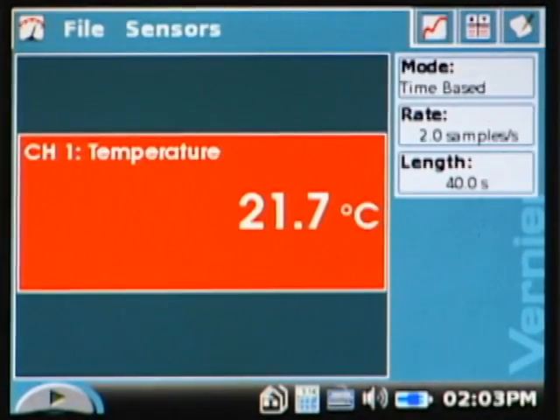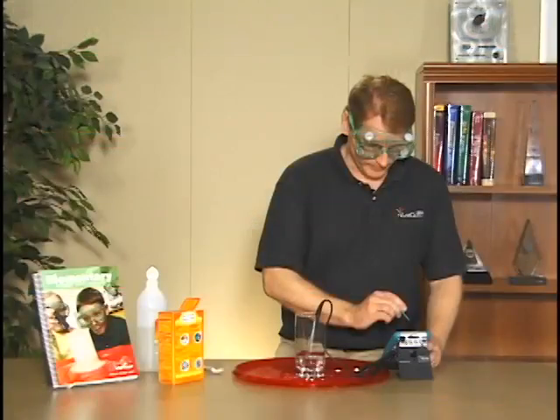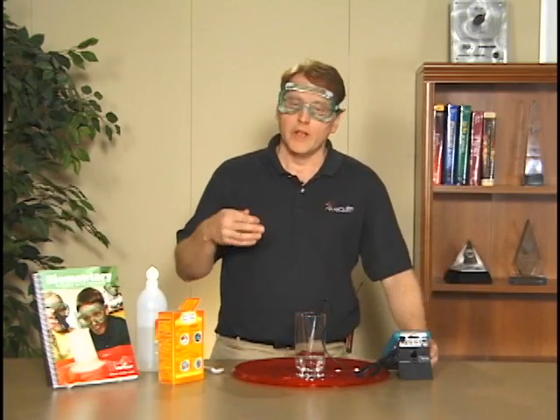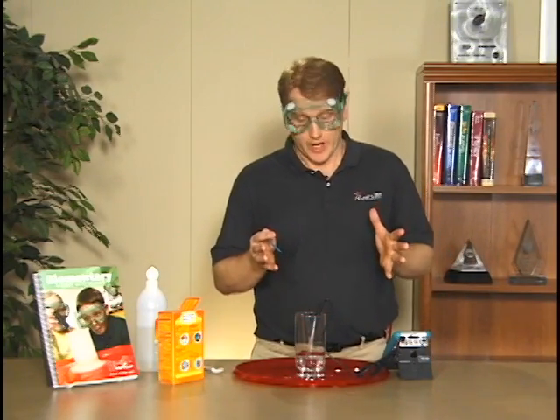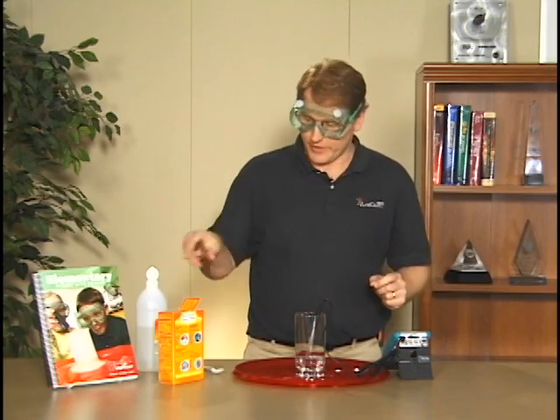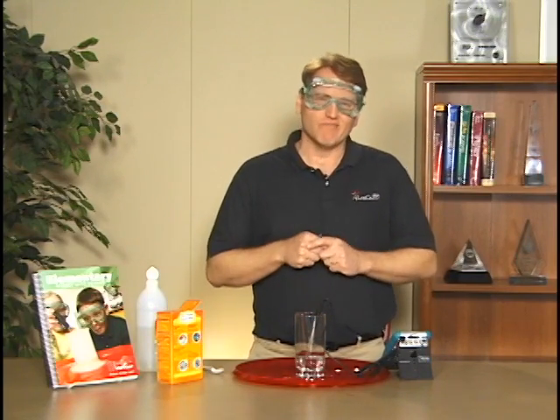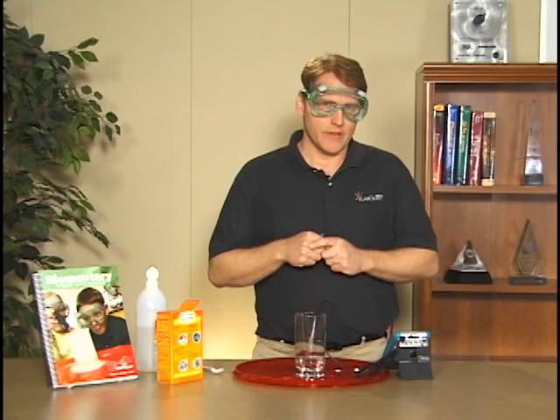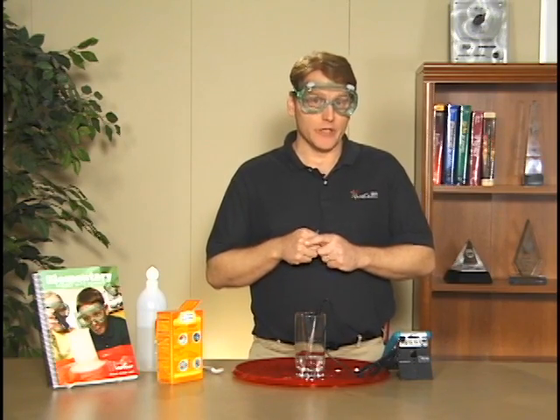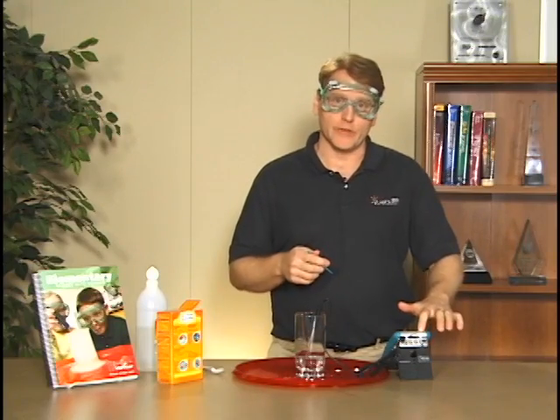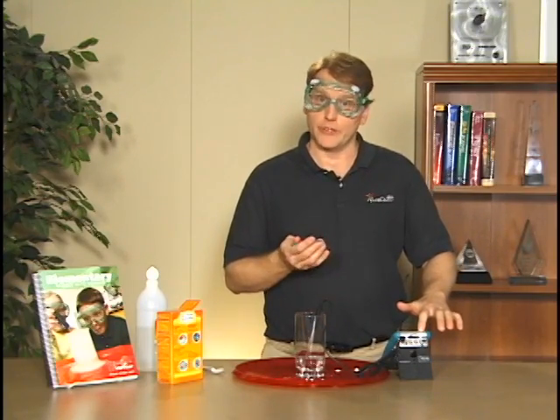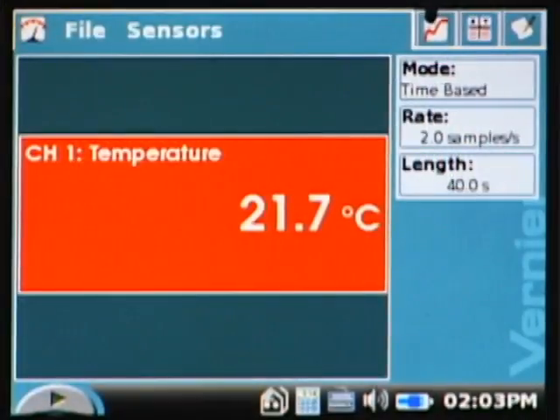I'm now ready to collect. The lab says to start collection for about 5 seconds before we actually add the other reactant. But before I start, I want to think about this for a second. Maybe I want to draw a prediction—a lot of labs have you do predictions, and the LabQuest unit has the ability to do a prediction on board.